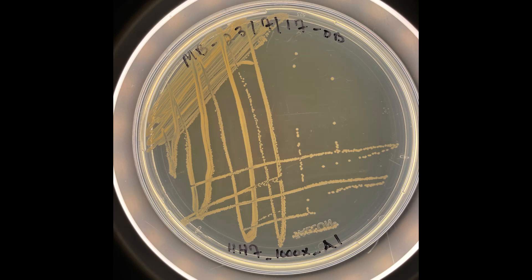As you can see here, this is the plate after 24 hours. There's quite a bit of growth. You can see that there's a dilution from all the streaks going from very concentrated in bacteria to isolated colonies.